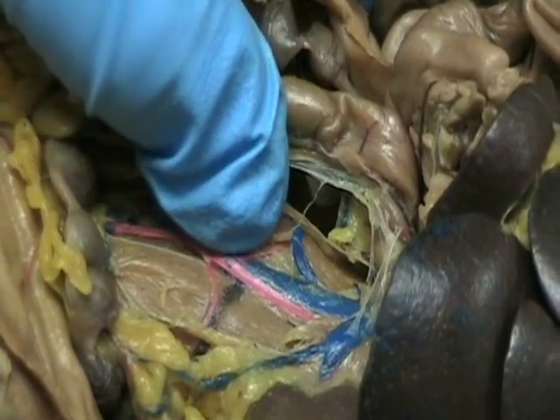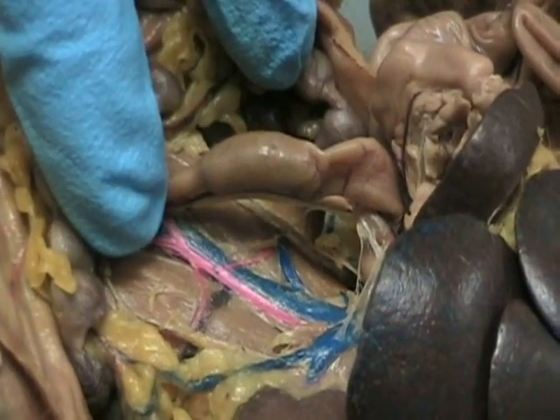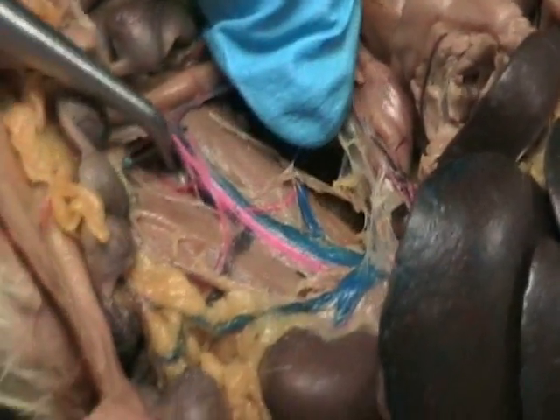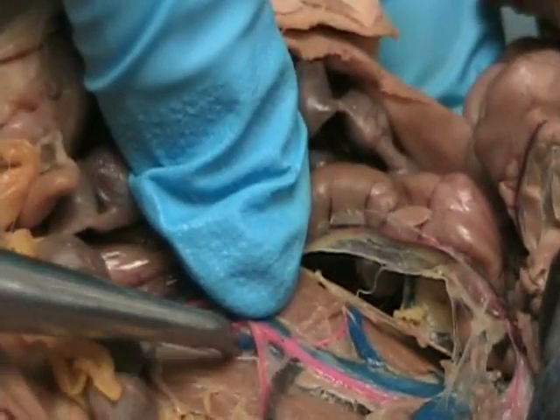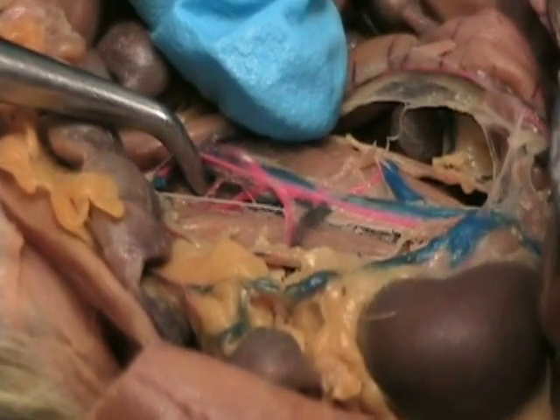The only thing that I did forget to put on here, the only artery that I did, was this one right here, the median sacral artery, which to find, you take one of the iliacs and you pull it up, and you can see it underneath. And it kind of is going backwards. So you take, do you see that one going towards the back right here? Oh, yes. Alright, so that's the one that we want. That's the median sacral.